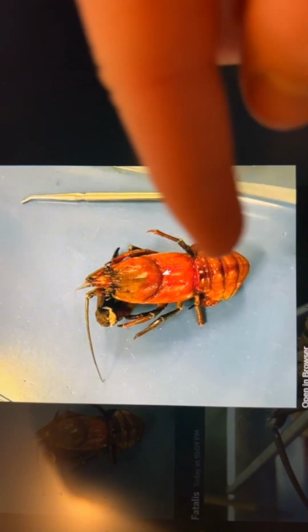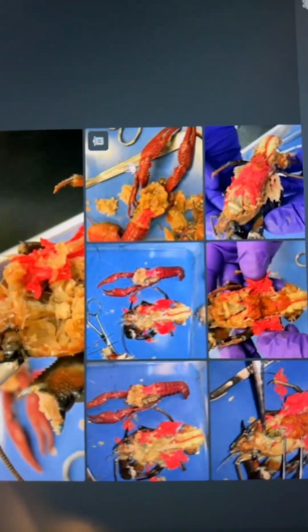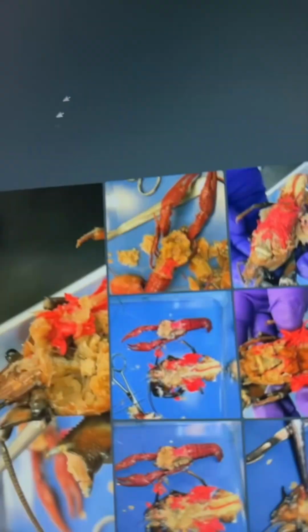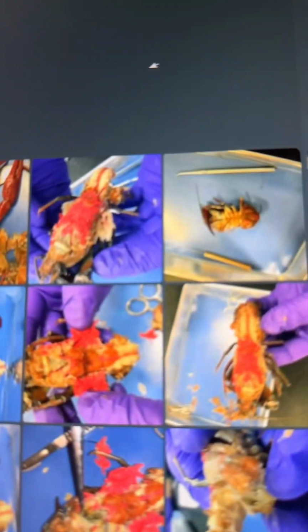But we're also noticing that the abdomen is going to come down in these segments and culminate in this fan-shaped tail, as we can see down here. It's also going to have these two large pincers, and on its underside, if we have a picture of that, we are going to notice that it has these walking legs, and then underneath the tail, swimmerets, where a male is going to have a large, pronounced first pair of swimmerets.